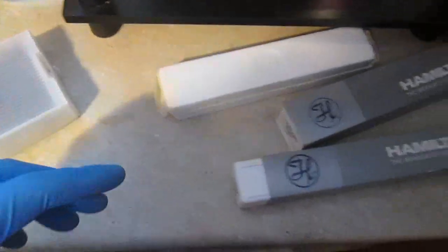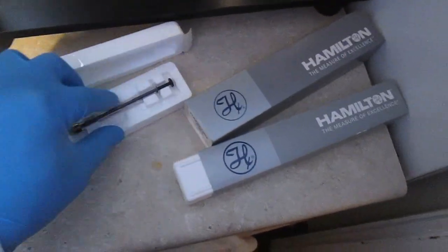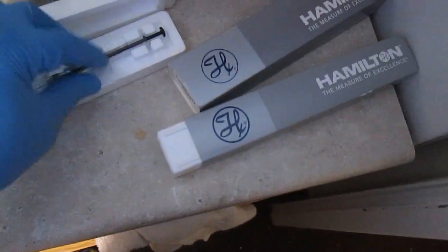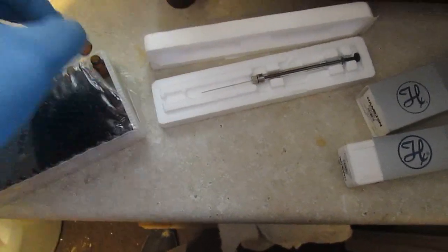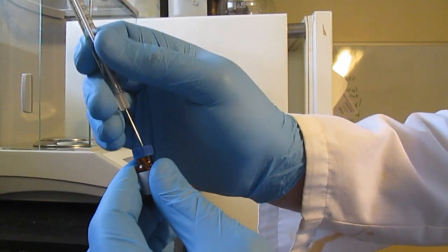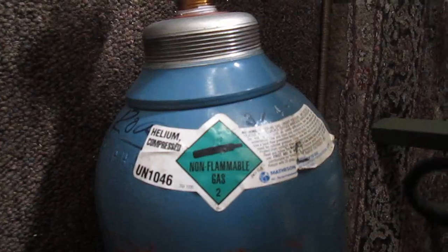Each analyte I want to qualify and quantify is prepared using high-quality specific syringes for precise volume delivery, from 500 down to 1 microliter. The final standard is then stored in amber glass vials so they can be easily drawn and injected into the GC. I use helium as the carrier gas.